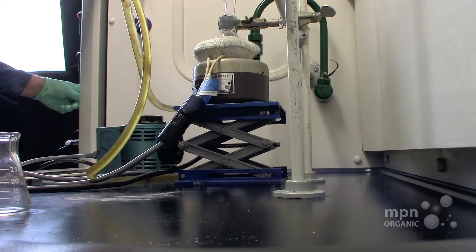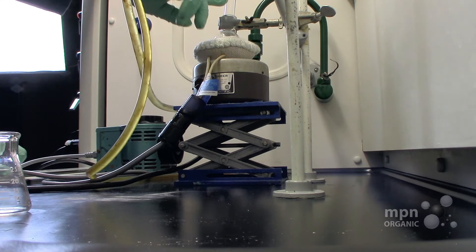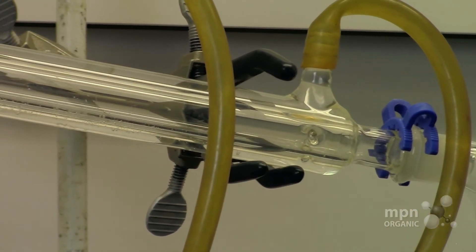The only reason that people would use a Claisen connector is to perhaps put in some column packing here to get a kind of a fractional distillation effect.